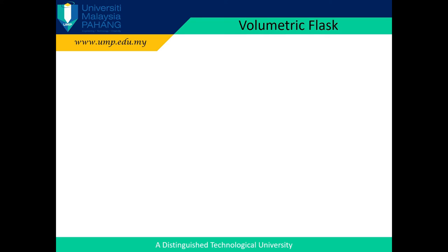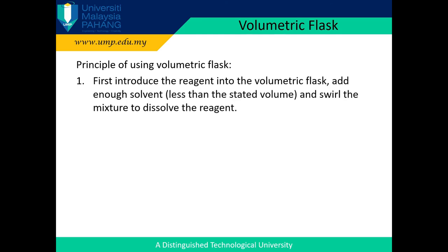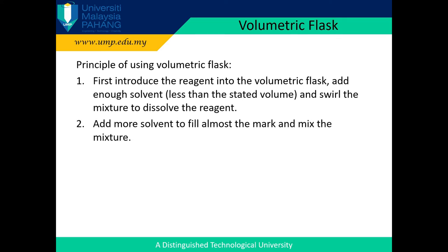Another familiar apparatus is the volumetric flask. The principles of using it are, first, introduce the reagent into the volumetric flask. Add enough solvent, which is less than the stated volume, and swirl the mixture to dissolve the reagent. Add more solvent to fill almost to the mark and mix the mixture.